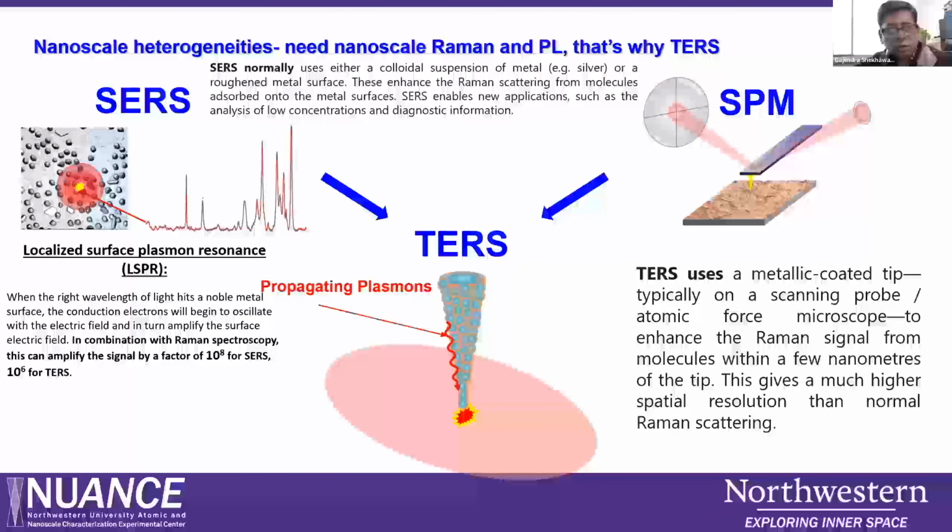almost a couple of decades back, SERS, surface enhanced Raman spectroscopy, evolved, where instead of using simple planar thin films or structures, they use nanoparticles to enhance or amplify the signals by a factor of 10^8 or 9. And in this case, even if you have a very low concentration of molecules, you can analyze them with SERS spectroscopy. But the problem is still the resolution.